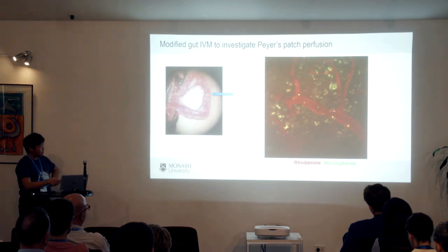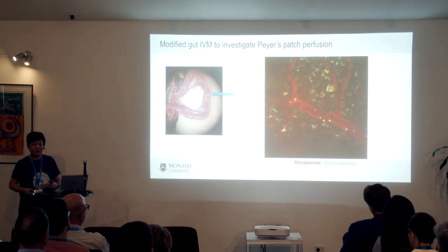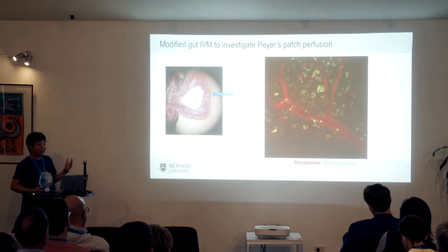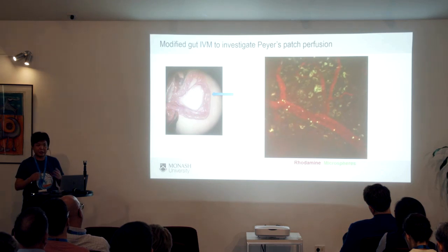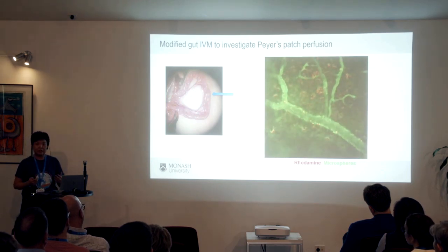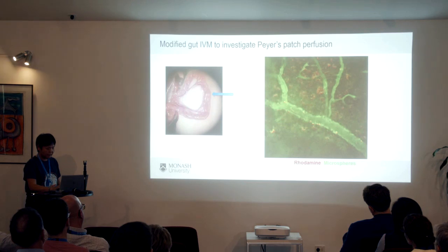The senior researcher from that lab, we met in a conference just like this, and I told him what we can do, and he told me what questions he has to answer. Light sheet microscopy is amazing because it's clear, it's transparent tissue, but it doesn't allow you to see action. What we can do in intravital microscopy is that we can watch perfusion happening live.